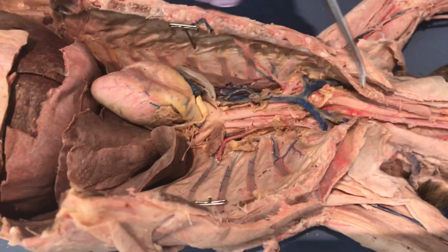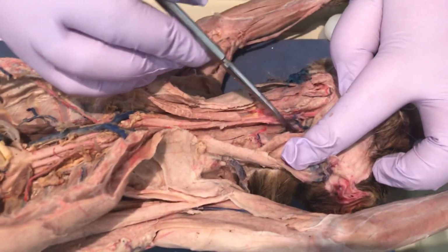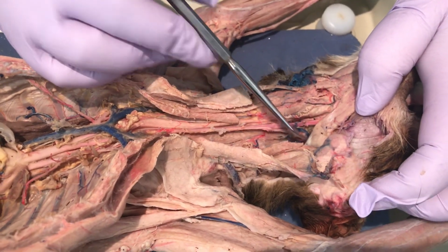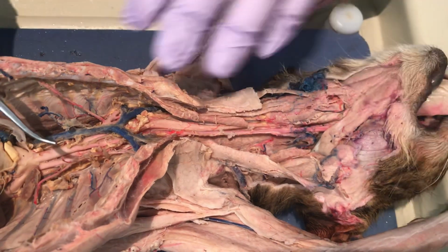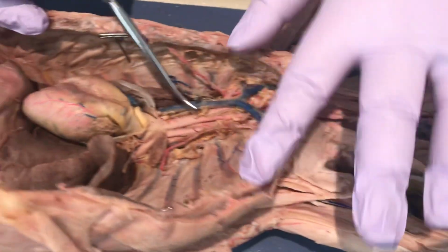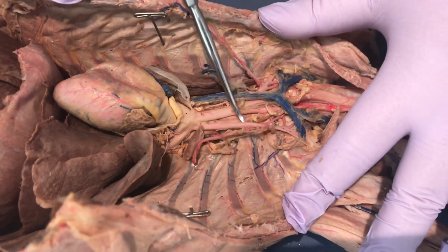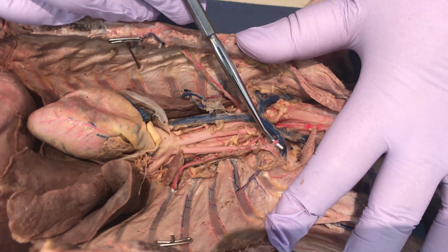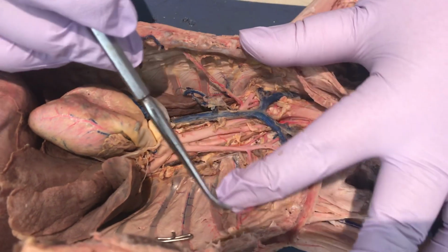All right, for both of the carotids, they're going to come up into the neck, and then they branch. One of them is going to head towards the outside, that's the external carotid, and this one heading towards the inside is the internal carotid. All right, this one right here is the left subclavian. Left subclavian has all the same arteries as the right: vertebral, costocervical, thyrocervical, and here's that internal mammary.